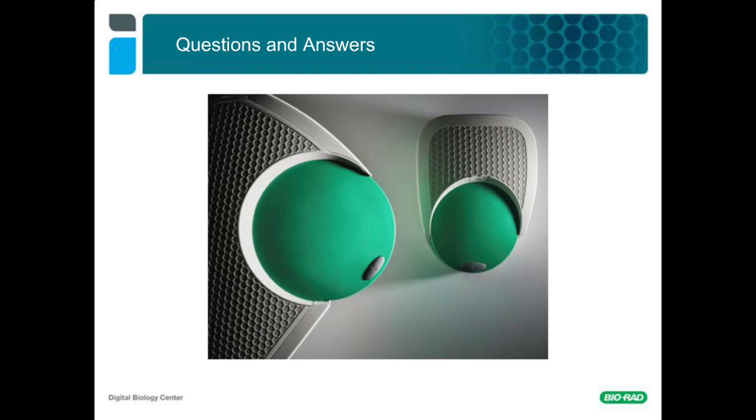So that is actually an interesting observation if that's happening down the column. I can think of two things off the top of my head. One would be to ensure that they're mixing their supermix properly, as you wouldn't want some of the wells to have more assay than other wells, which could change your baseline fluorescence. And the second thing that I can think of is making sure that they use the 98 degrees at the end of the thermal cycling protocol for 10 minutes. So just to ensure that their protocol cycling parameters are as close as possible to the ones that we have recommended.